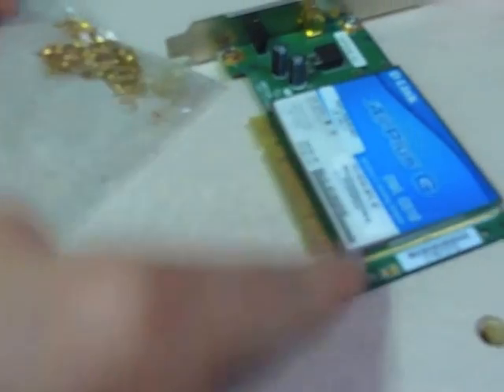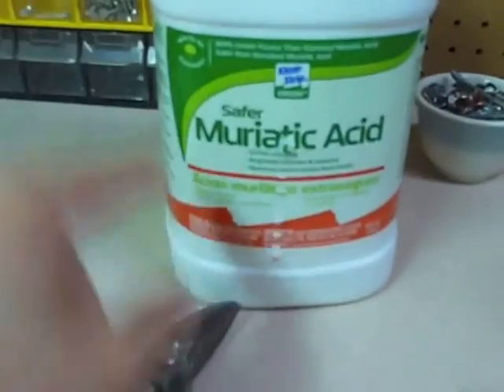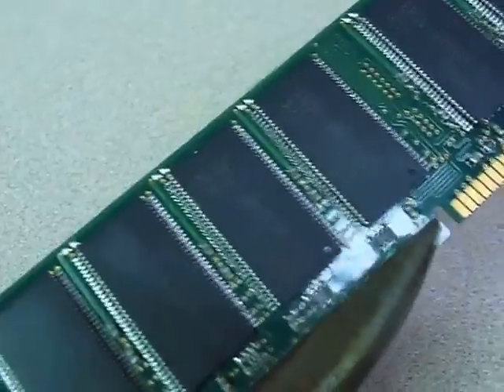With my method, you get pure gold, because you dissolve the copper out. Basically, what I'm going to do is cut the gold fingers off of these cards and RAM, and put them in this jar with a mixture of muriatic acid — which is hydrochloric acid — and hydrogen peroxide. It's really easy to use tin snips or some kind of wire cutter or pliers to cut off the gold fingers like that.